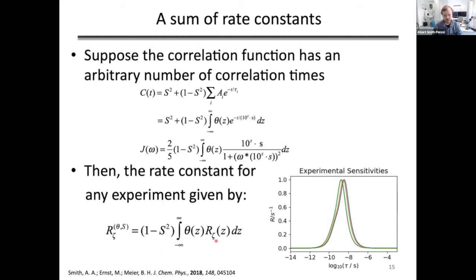And if you take it like this, you can think of a relaxation rate constant that you've measured as a window into the motion at a given range of correlation time. So at 850 megahertz, this green line is my window into my motion. And just to give you an idea.